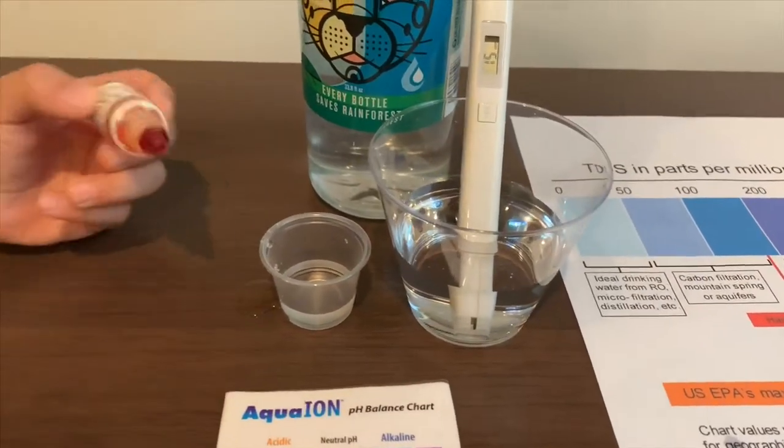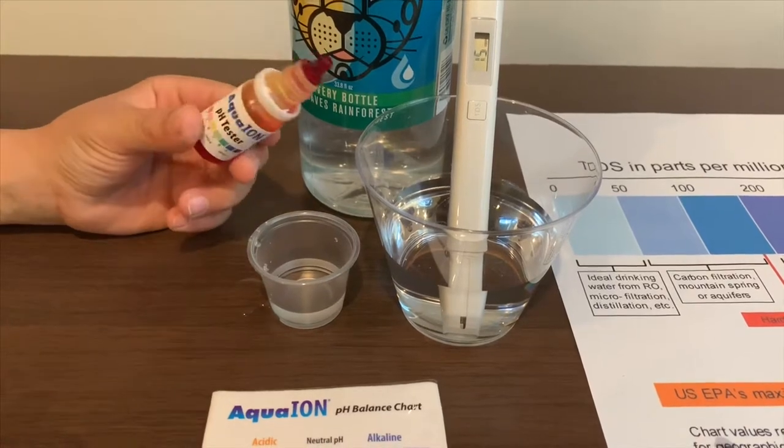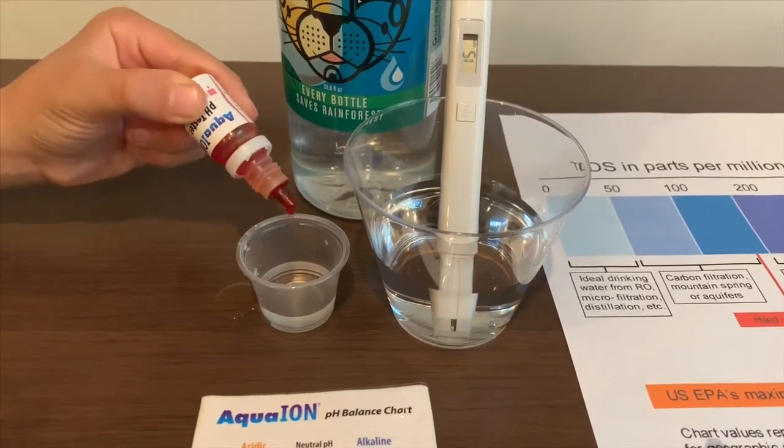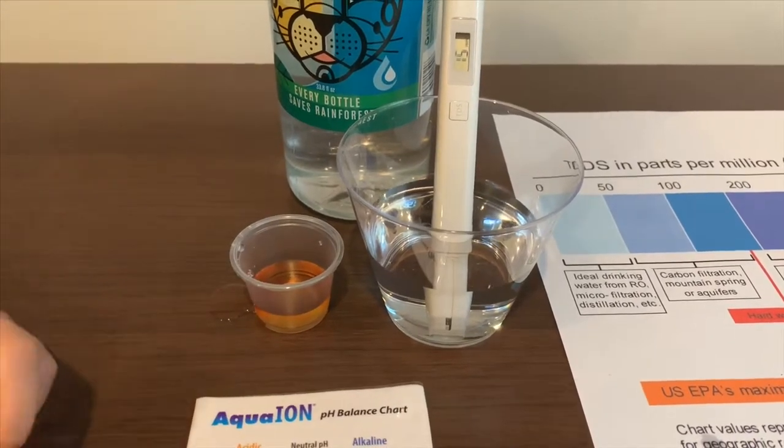Now let's test the pH level. If you want to buy this pH tester, check the link down below. Only do two drops. Let's stir it a little.